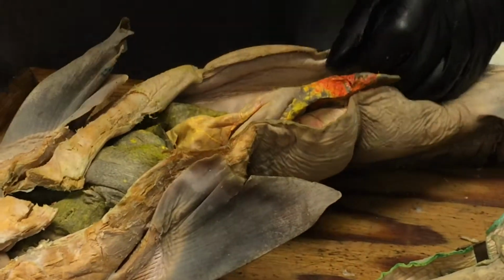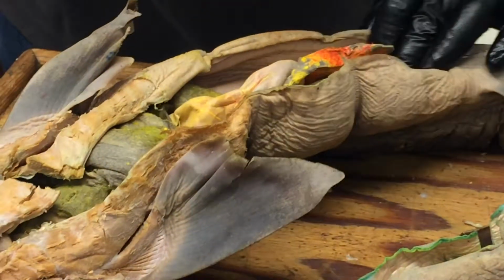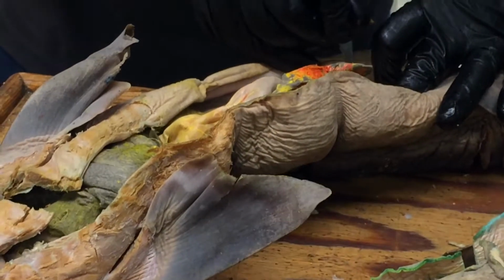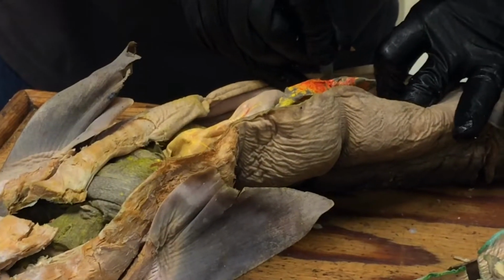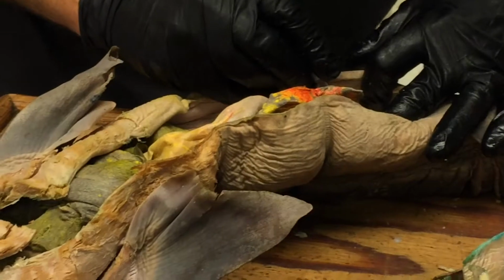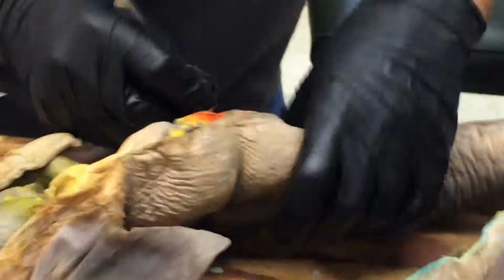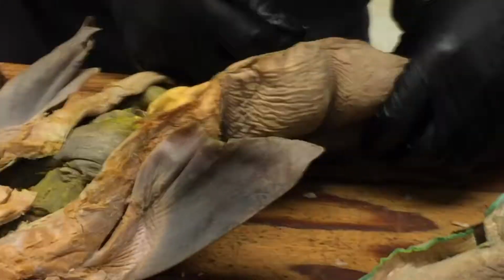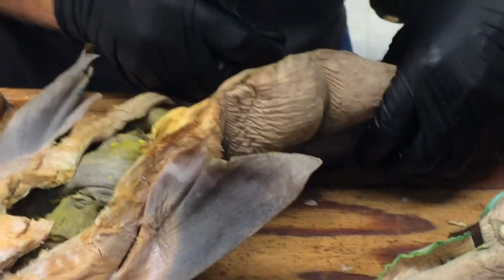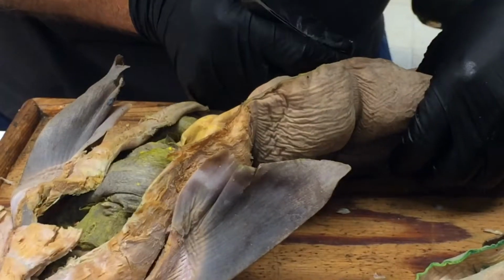All right, this won't take long. This is our last thing, so it won't take too long. I'm trying to find the urinary sinus. Just make a little bit of an incision here. It doesn't look like it's dyed as hard as ours. I mean, it's latex. No, it has not exploded, which is nice. Is that what happened to yours? Yeah. And the question is, does the lack of color actually make it harder to find this stuff? That remains to be seen.